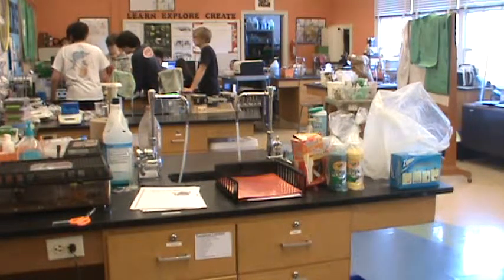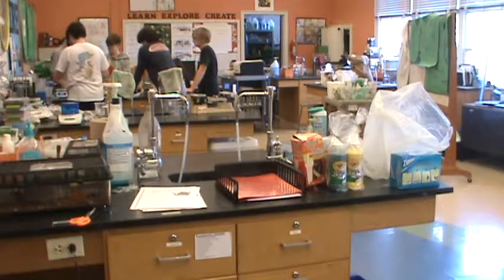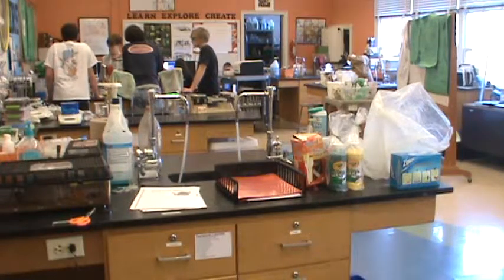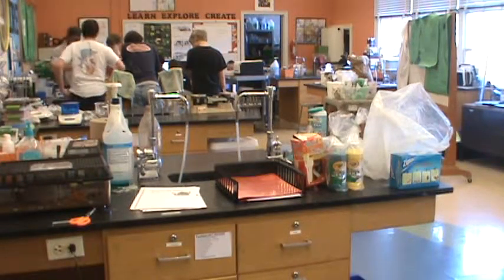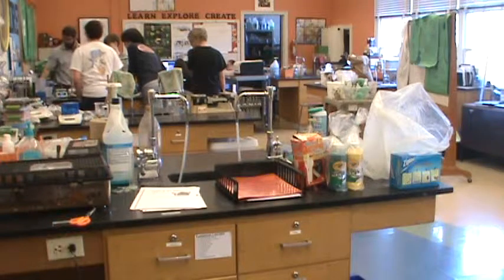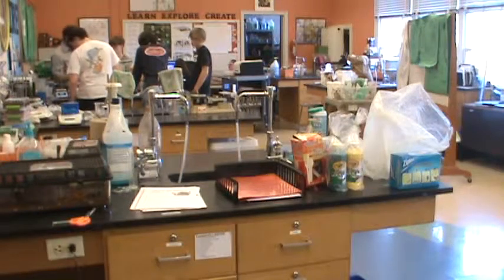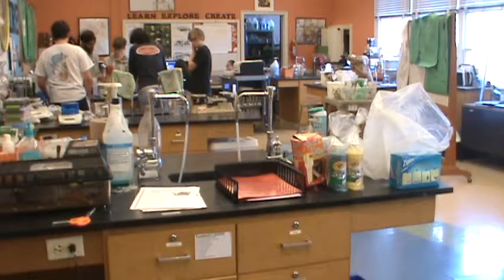You guys see that? Alright, so you're going to put it there, and then you're going to put the desired amount right inside. So what I would do is get enough from over there, make sure you have enough, and then back over here with a little sweep, and just keep going. Then this comes off, and put it into a container, and that's going to be stirred up so you get all the powders in. Then you start adding some water to it.